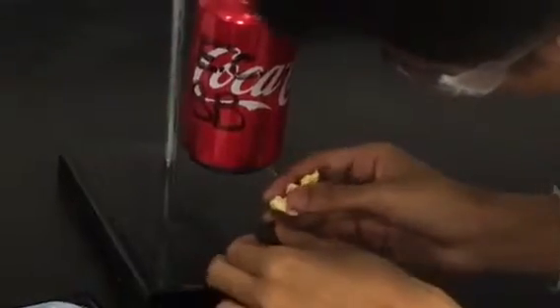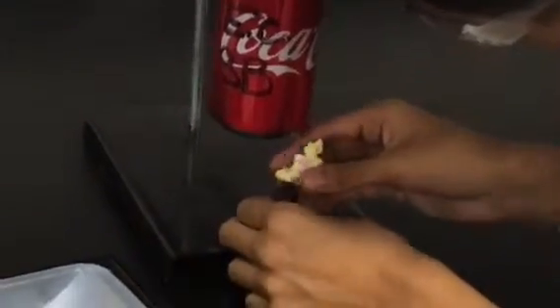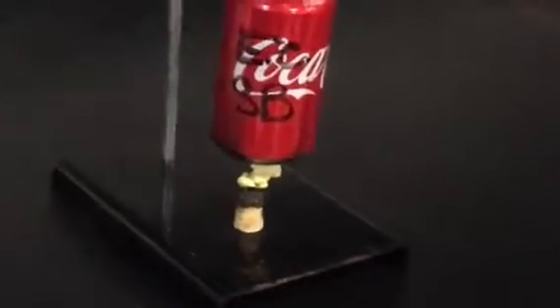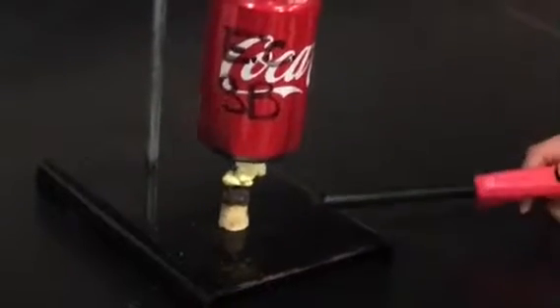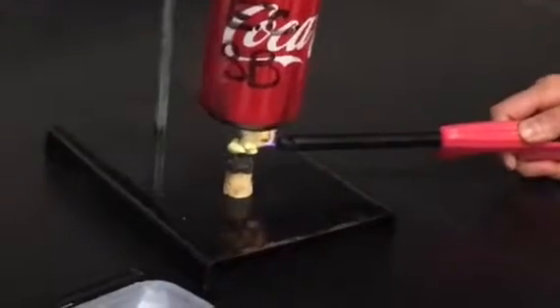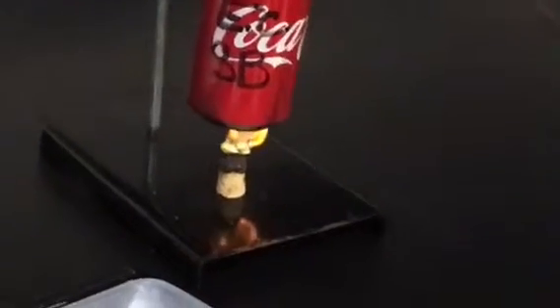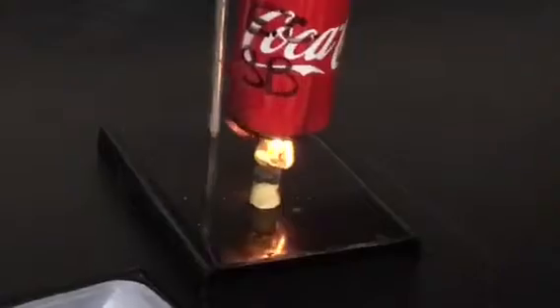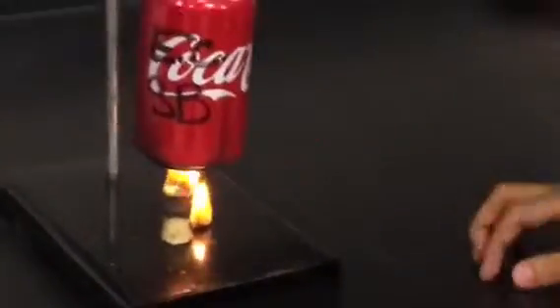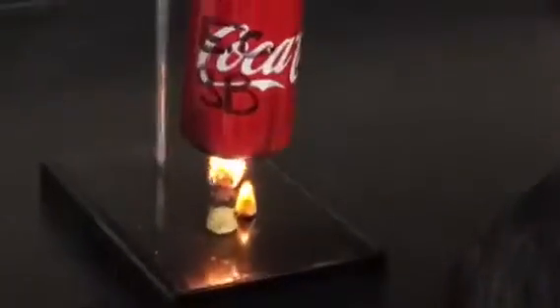The corn is still a chemical. We gotta be efficient, guys. Is your water ready? Let her rip. Put it as much as you want. Ready? You got your matchsticks out. 50 milliliters of water. Alright, where's our thing where we can hang this? You need a stirring rod? Is it burning the cork? No, the cork is fine.